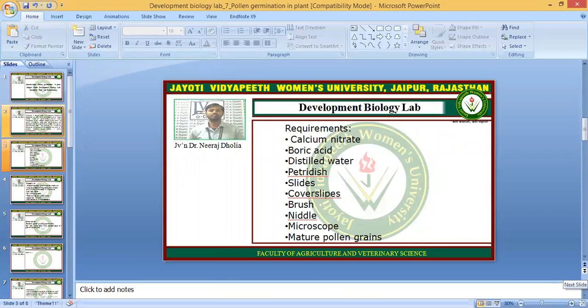For the practical, we need some reagents and instruments. The requirements are: calcium nitrate, boric acid, distilled water, a petri dish, slides, cover slips, a brush, a needle, a microscope, and mature pollen grains.